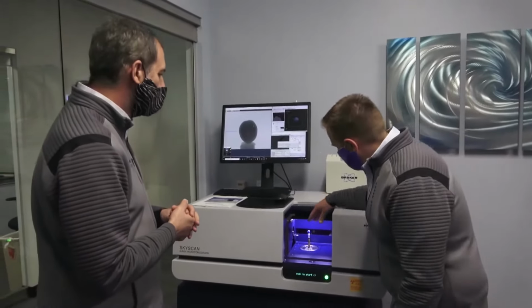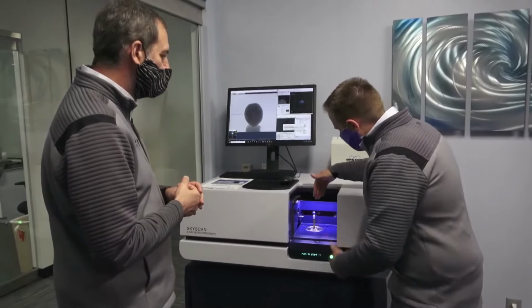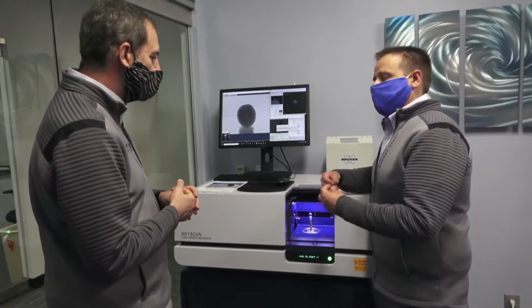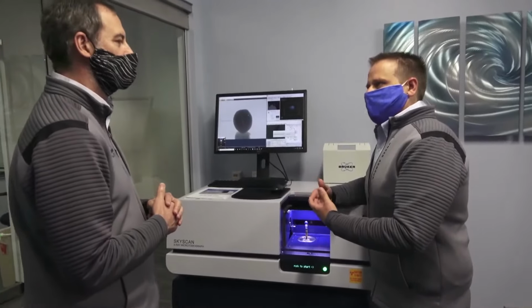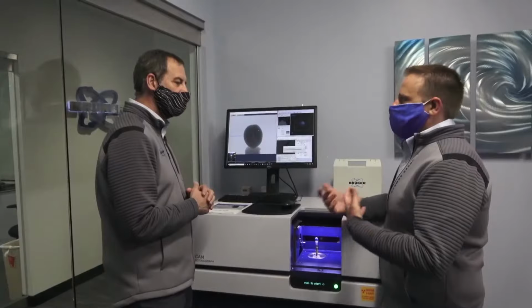Now, in terms of the samples themselves, from the video, I remember the closer you can get the sample to the source, the better the resolution will become. That is correct. Okay, and then the farther back we go, the more the coverage. Correct. So the limitation just kind of centers around your resolution and coverage requirement.